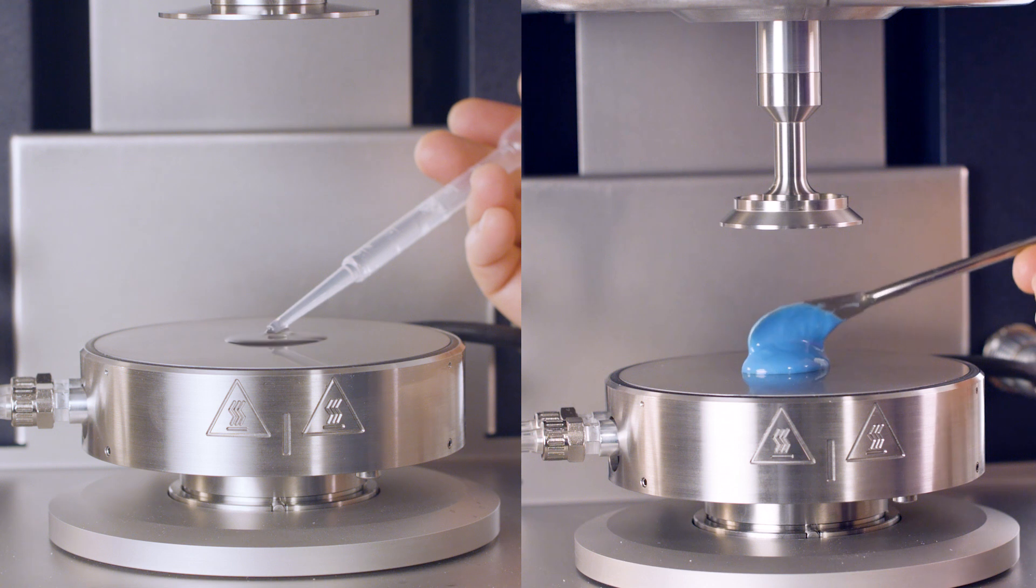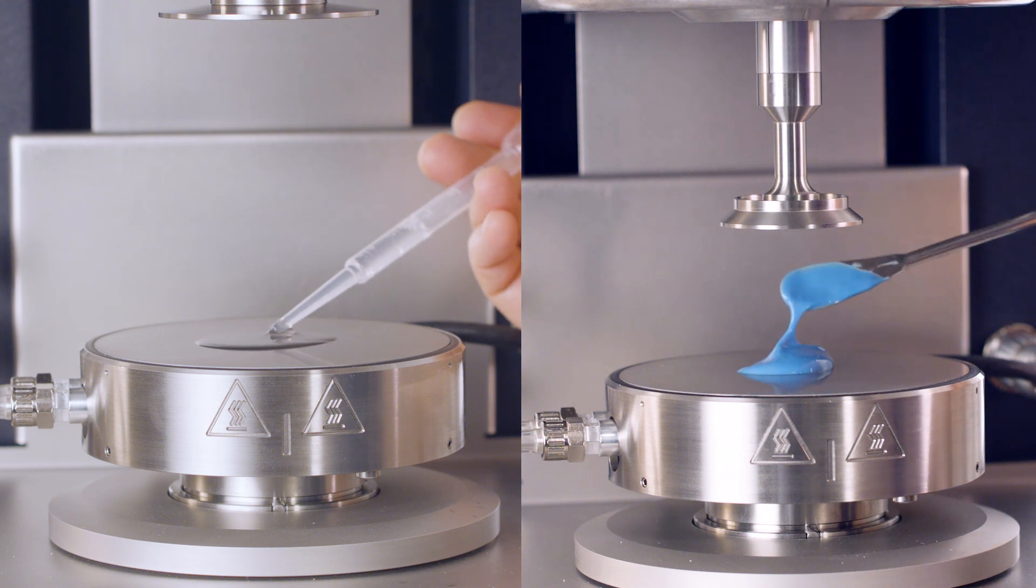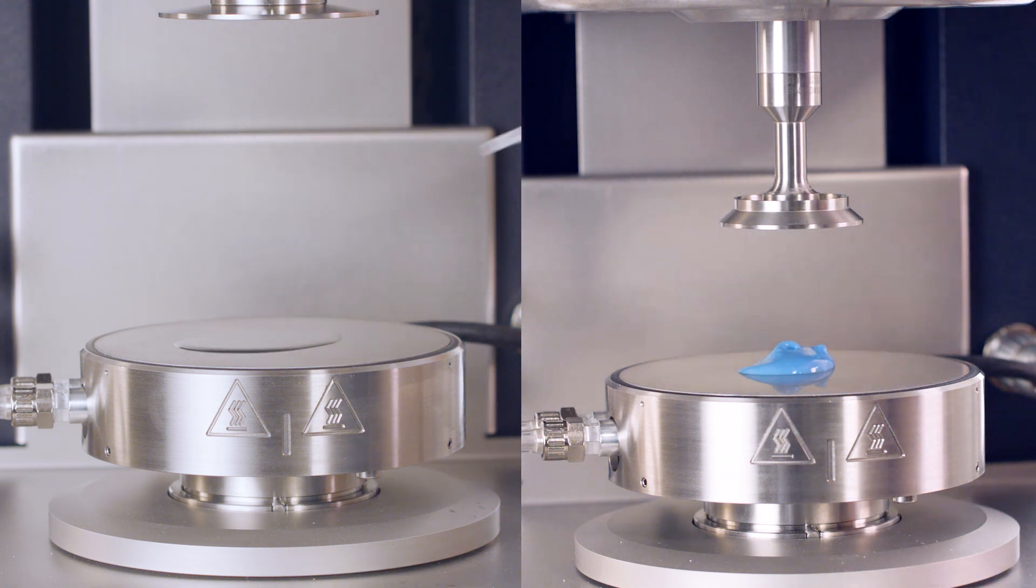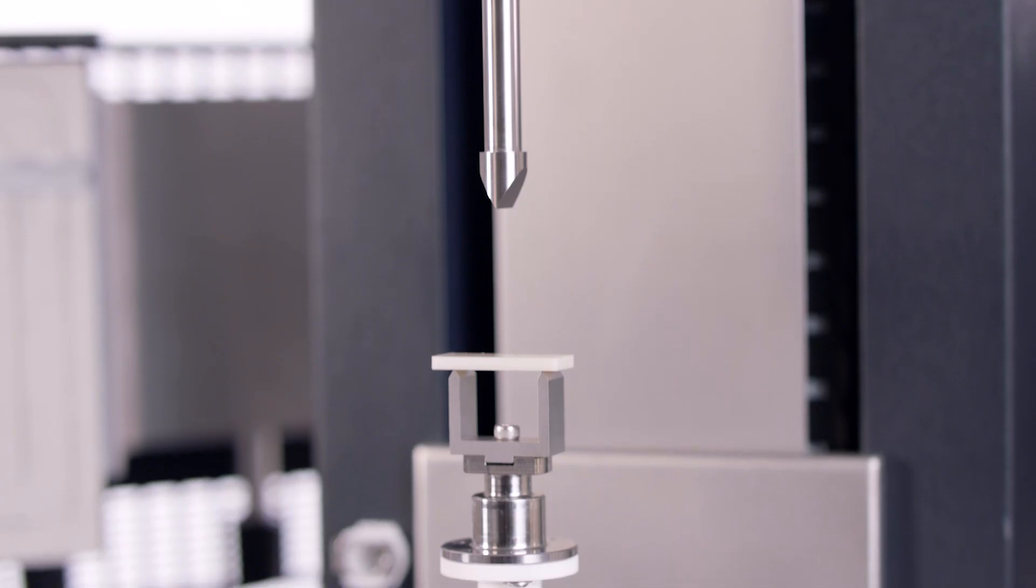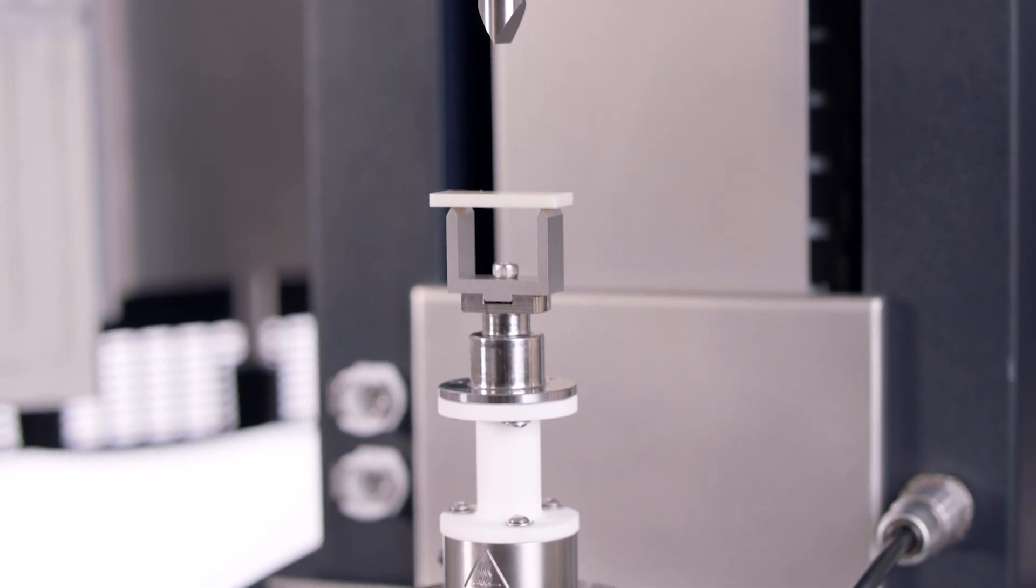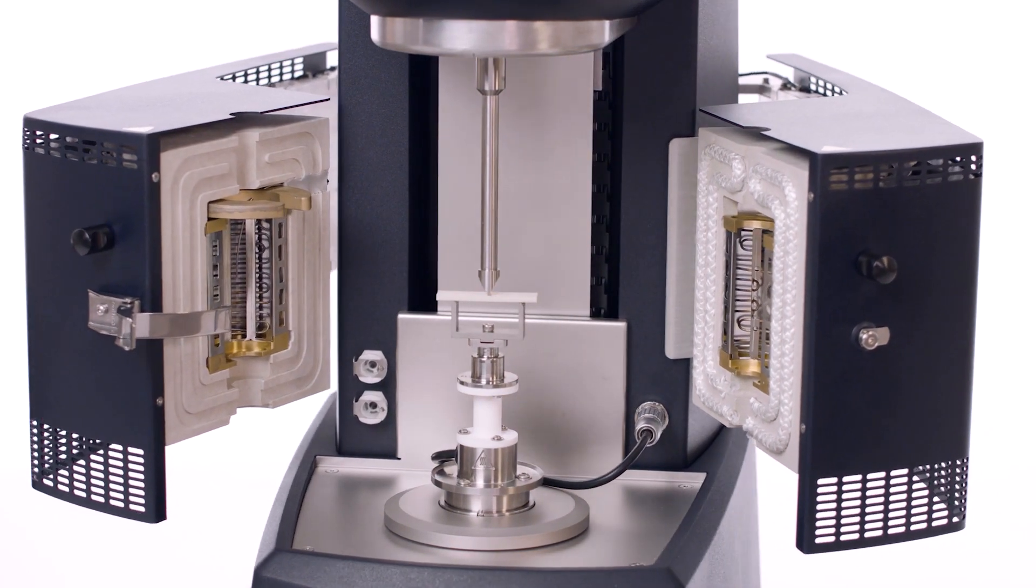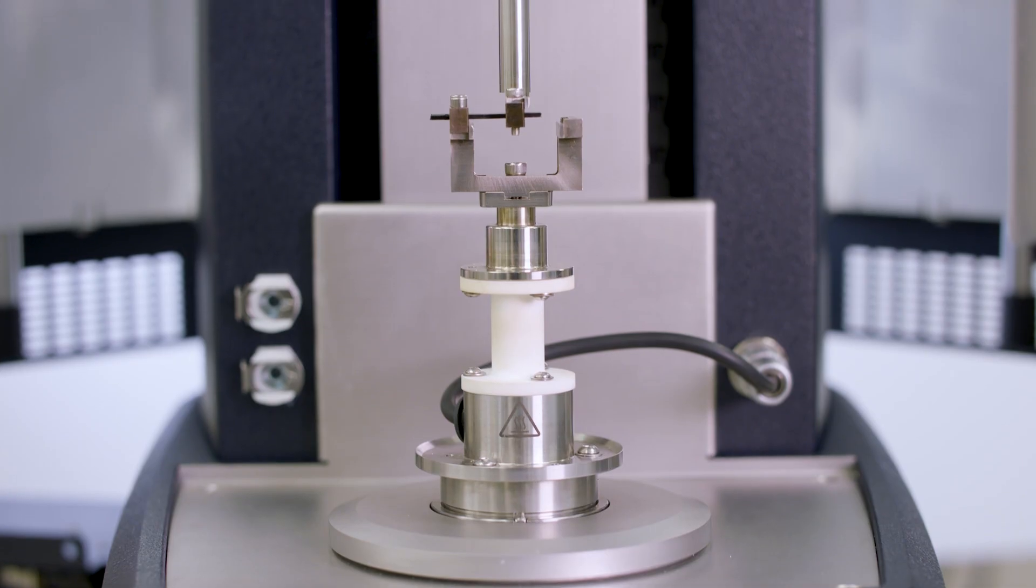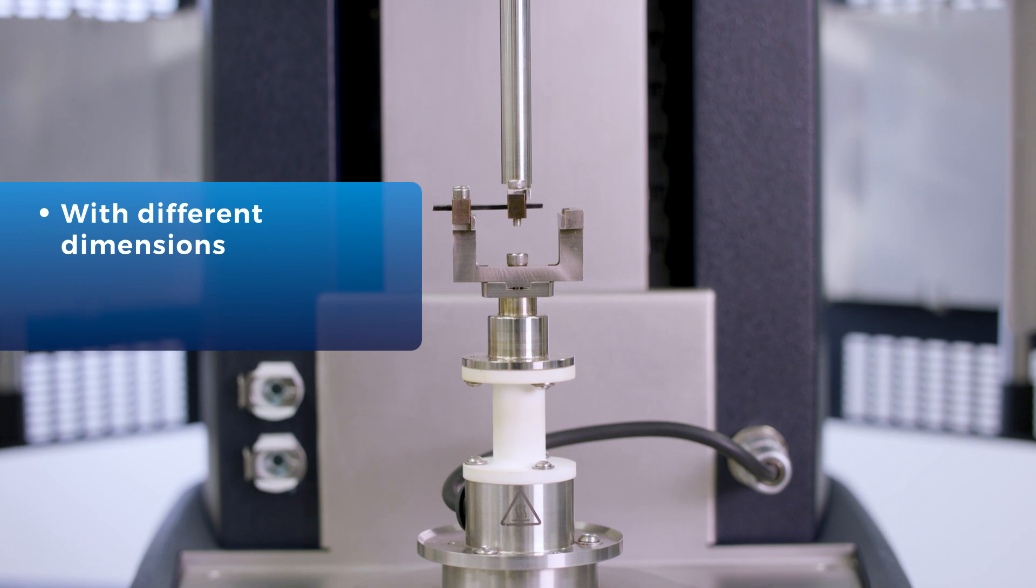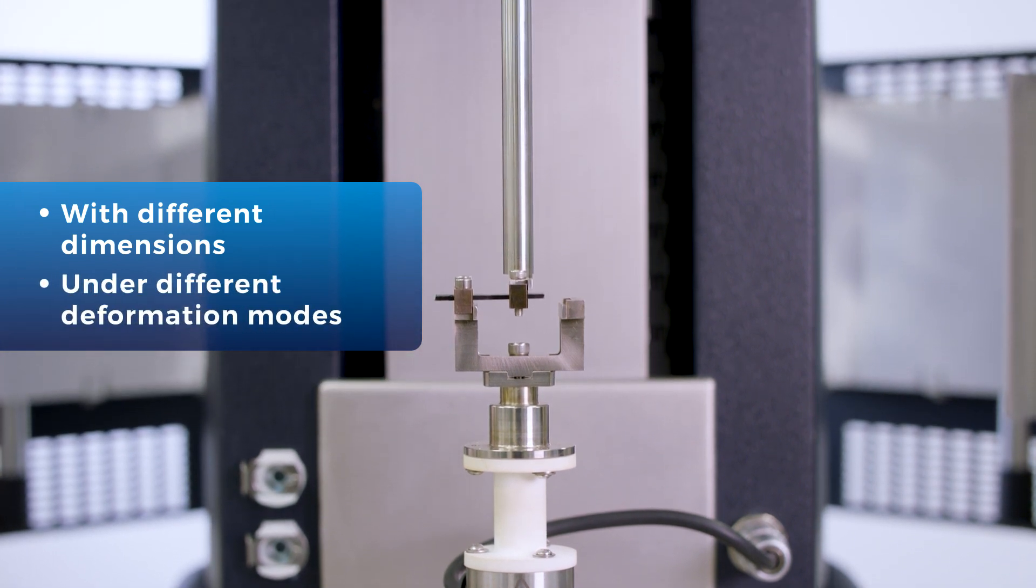Rotational rheometers are commonly used for testing liquid or paste-like samples through cone and plate and parallel plate geometries. The Discovery Hybrid Rheometer from TA Instruments offers the unique capability of testing solid samples with different dimensions as well as under different deformation modes.